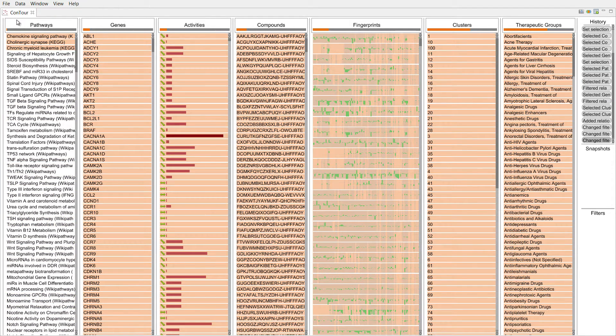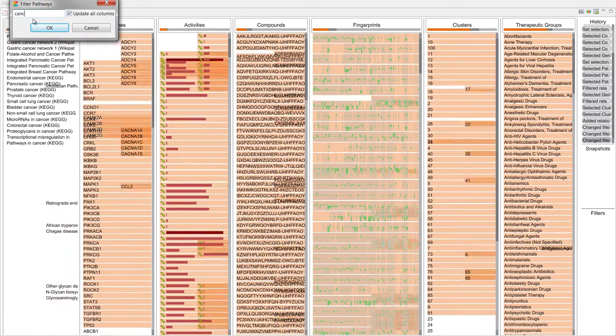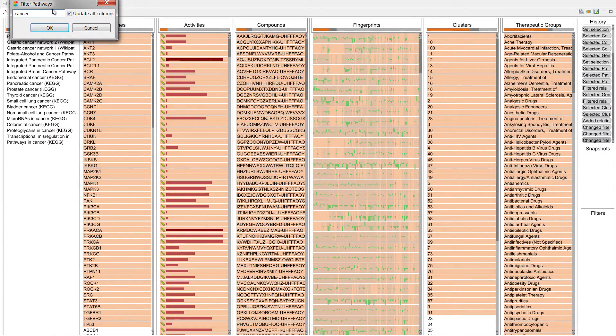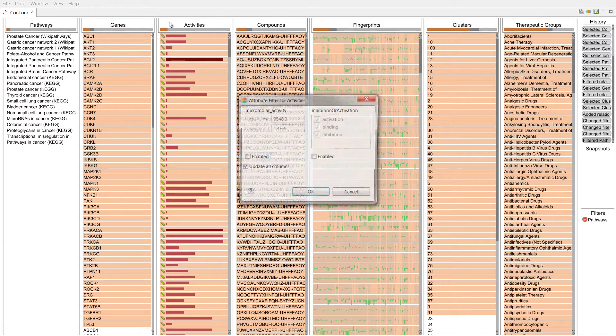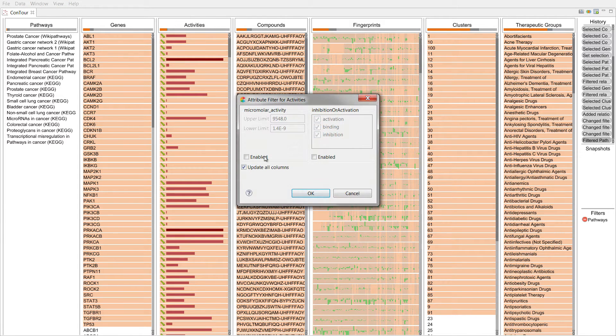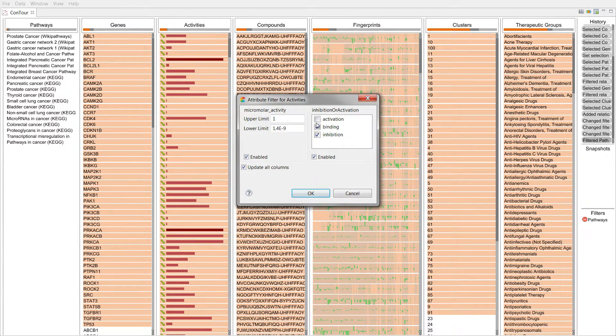Items can also be filtered based on item properties. For example, we can search for a keyword or filter based on numerical or categorical attributes. Here we set an upper limit for the micromolar activity and remove all activating compounds.